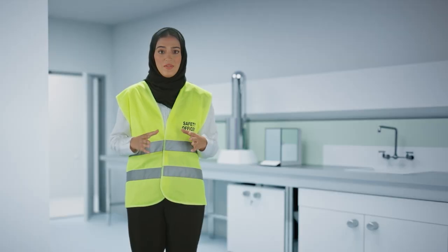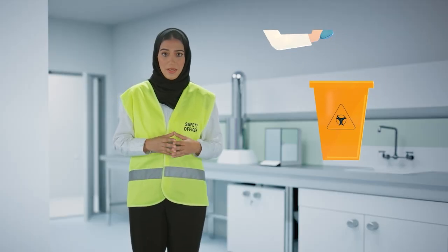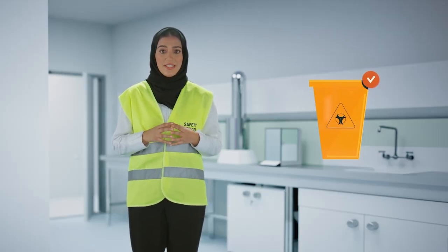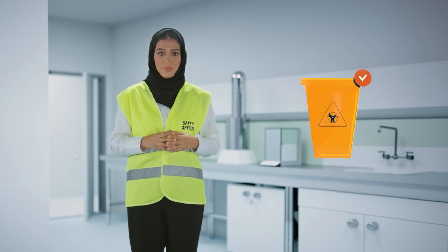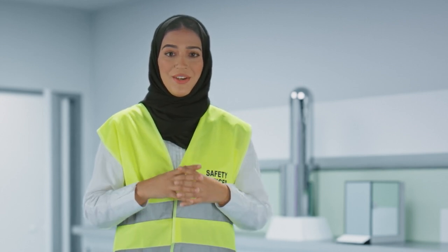Disposable gloves and gloves that have been permeated by a chemical must not be reused. These gloves cannot be reused safely because the chemical cannot be totally removed. Contaminated gloves may be recognized as hazardous waste material, but that is not always the case. In all instances, dispose of your used gloves in the designated hazardous waste container or as directed by your instructor.